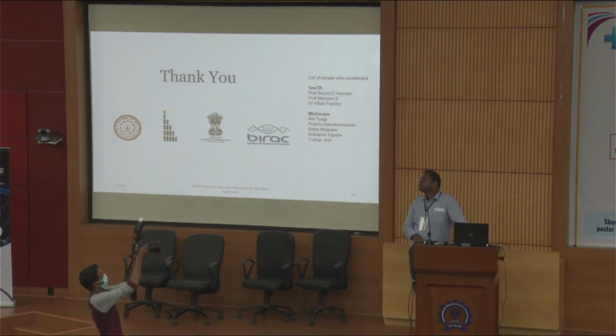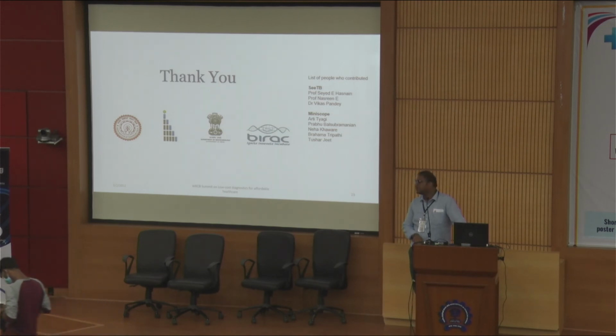Okay. So this is the same platform which is now being used with milk samples to test mastitis. There's no new innovation in the platform as such. The platform is basically an automated microscopy system with an analysis system, so you don't have somebody to screen one by one and take a decision. By automating it, you reduce the time and also improve the performance a little. Currently the microscopy is all done manually, and that part we are trying to overcome by using this kind of automated system.